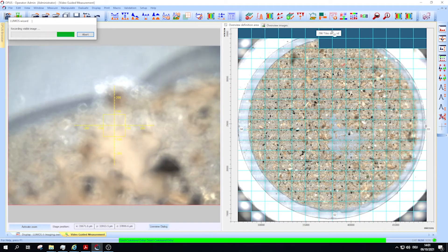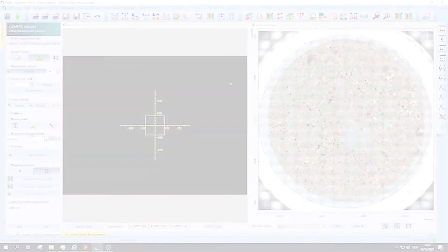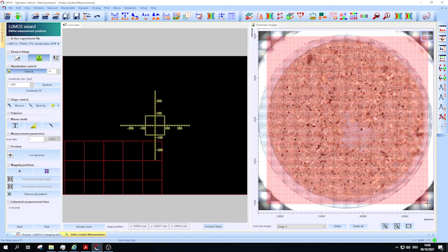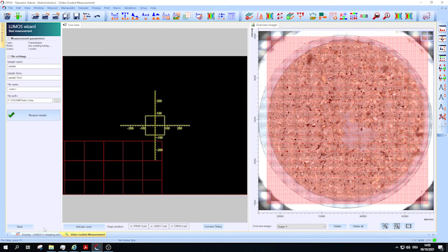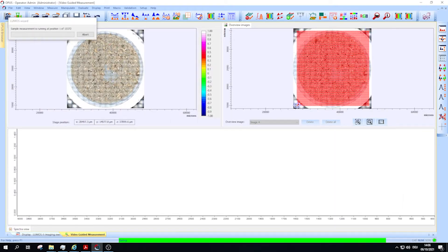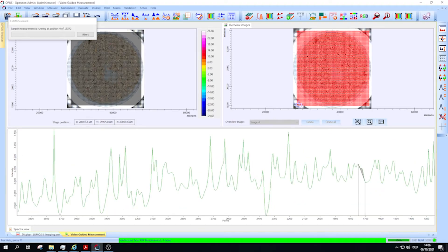First, we take an overview image to navigate the microplastic filter. Then, to begin the FTIR imaging, we simply select the region of interest, click next and type in a name, and finally start the measurement. With only three steps, we got our microplastic analyzer up and running.